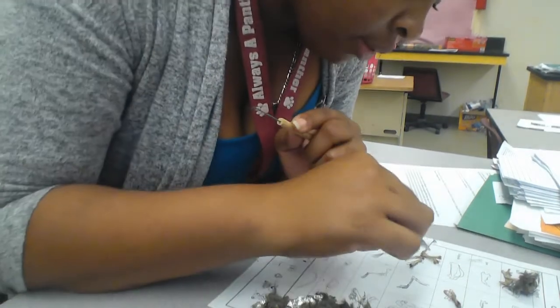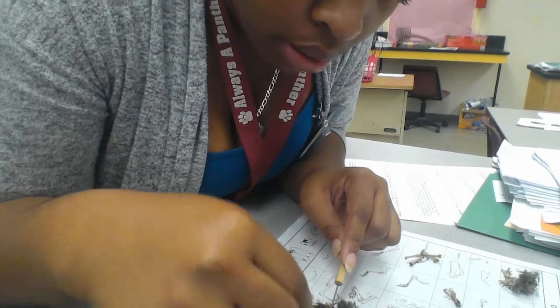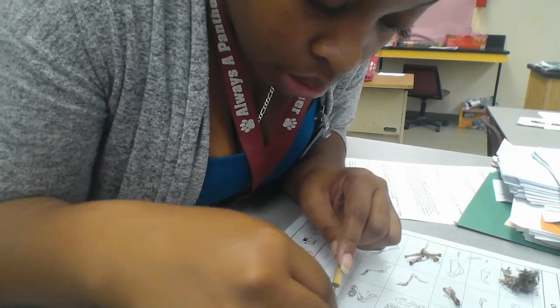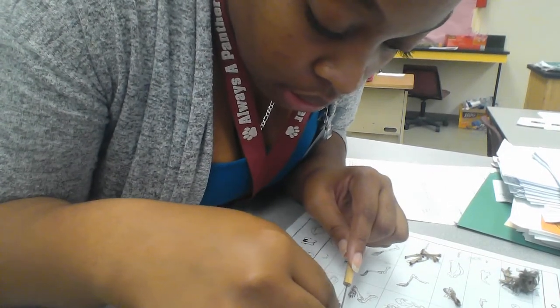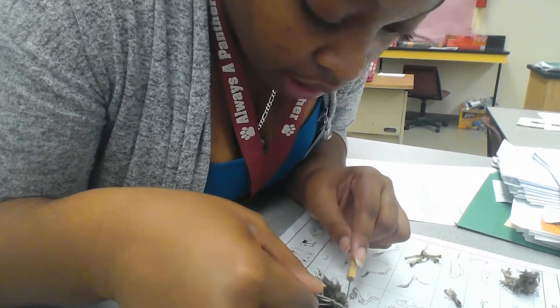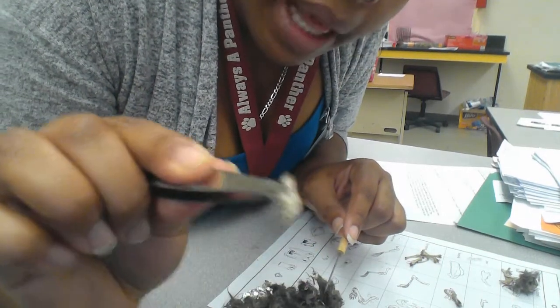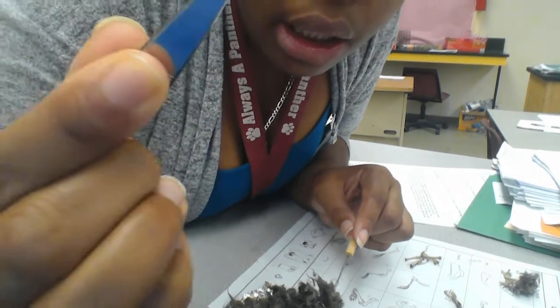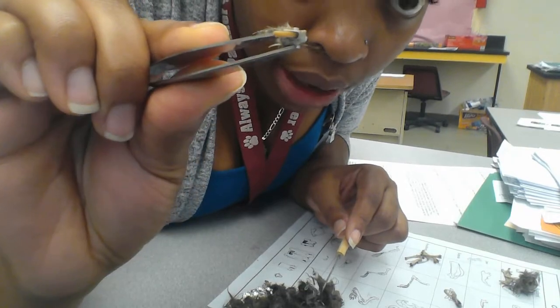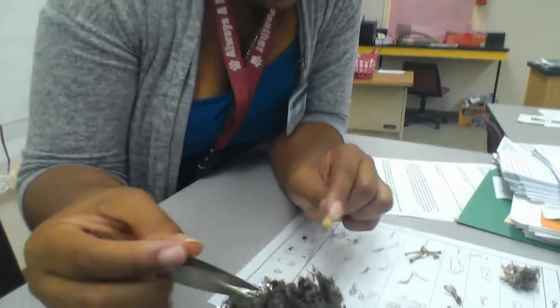Definitely, I feel like another piece of a forearm. So like I said, we should have 3 total forearms, 4 limbs, same thing. Oh, snap. Found another rodent. He ate a lot of rodents. I thought he was going to eat a lot of moles, but he clearly ate a lot of rodents. So this is going to be our 3rd rodent, which makes sense because we have 3 forearms.